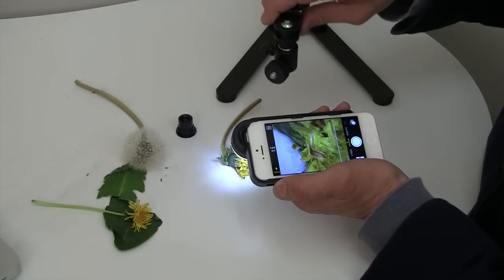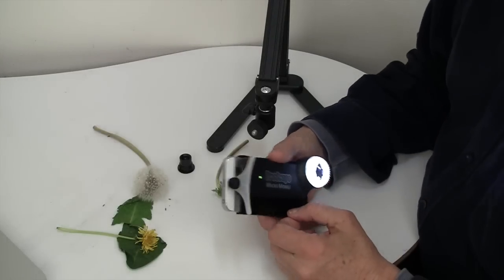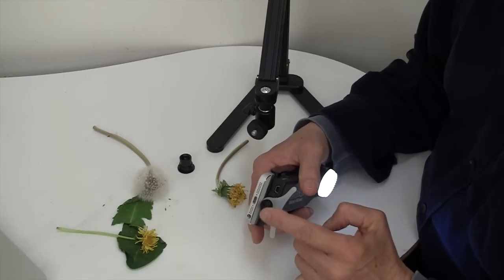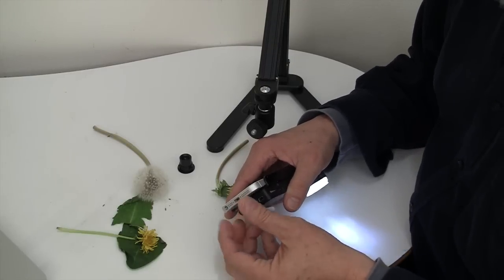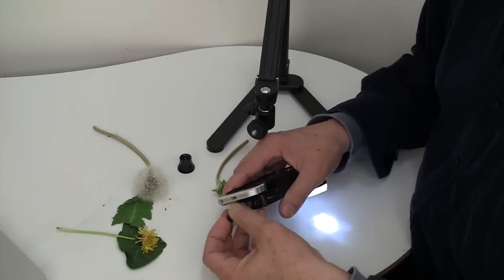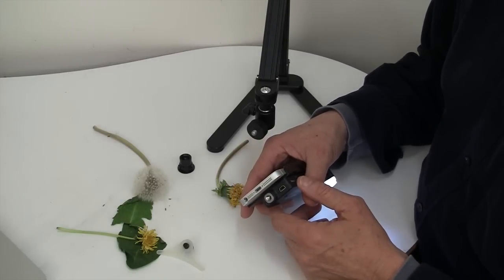On the back end of the ProScope Micromobile is our little stand. If I unscrew this nut right here, I reveal that there is a quarter-twenty tripod mount. That's perfect for any stand.